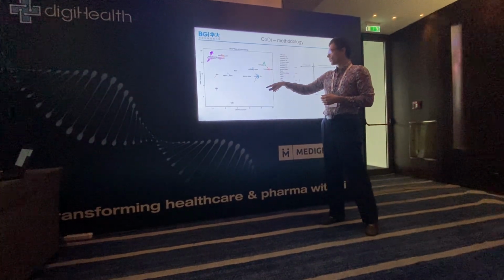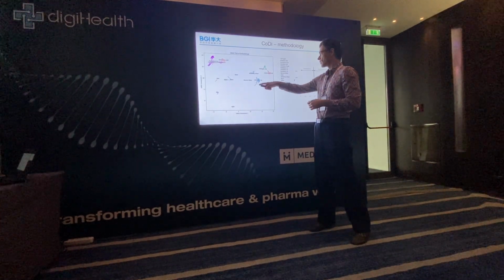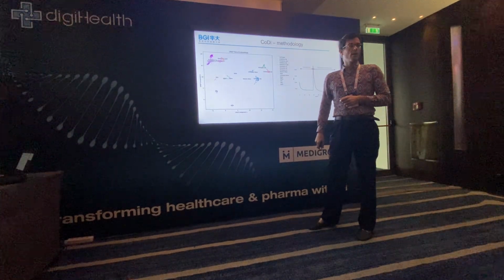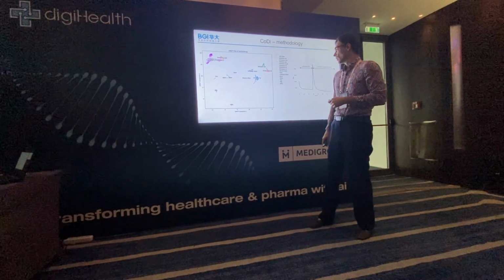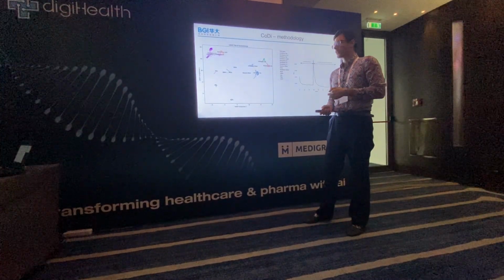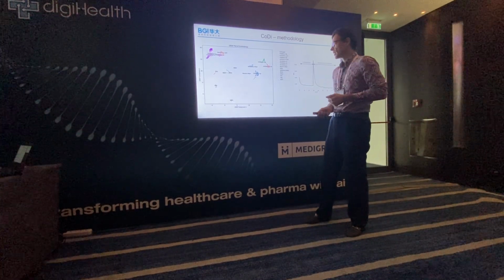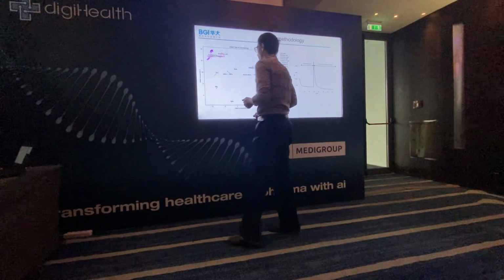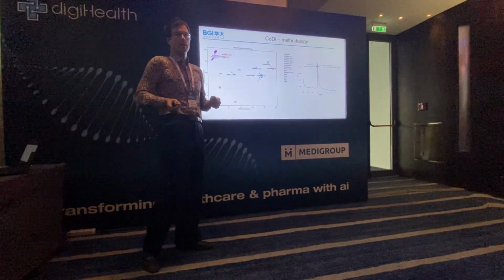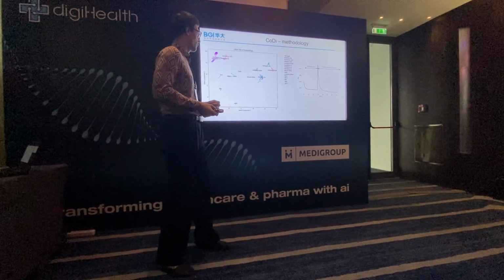So after we obtain embeddings and project them in the two-dimensional UMAP space, you can see that different cell types are positioned differently in this space. This is just an insight to see whether the task for the classifier that comes after it would be simple or difficult. So it can tell us some information: if they are separated easily in this space, then the classifier shouldn't have a tough task to do afterwards.